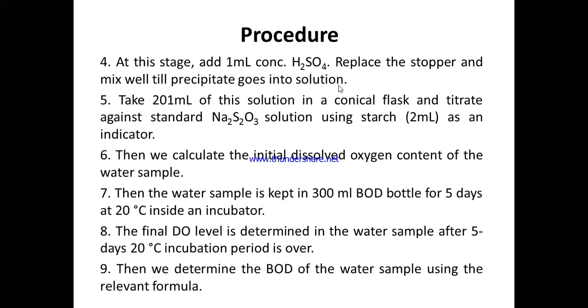ठीक, जैसे ही हम फ्लास्क में BOD सैंपल और स्टार्च इंडिकेटर ऐड करेंगे, it will turn blue in color या bluish green in color. ठीक है, कॉनिकल फ्लास्क में हमने BOD सैंपल लिया, we have added starch as indicator, it will either turn blue in color or bluish green in color. Okay, then we will titrate it against standard sodium thiosulfate solution.